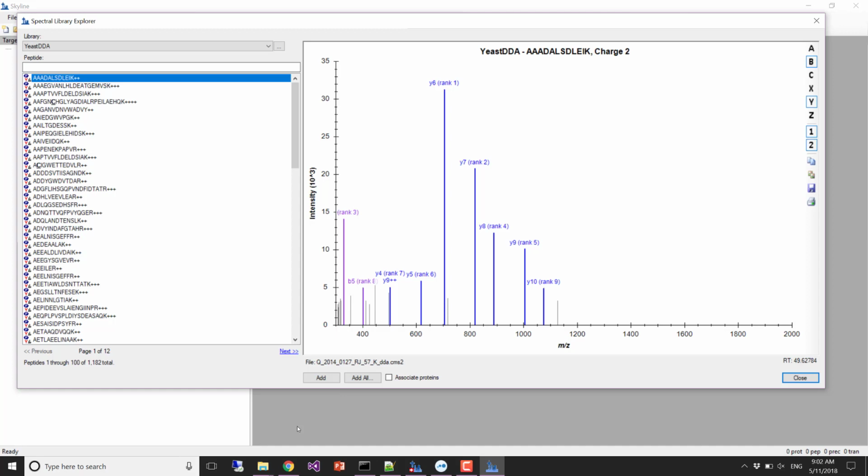Search engines report retention times in a variety of seconds and minutes, so we have to basically divide by 60 anytime that there's seconds, so that we get minutes to show. So you might have measured a 90-minute gradient and see times that are in the thousands. That just means the times were recorded in seconds and we didn't know about that. If any of those things happen, contact us and we'll work with you to get them fixed.